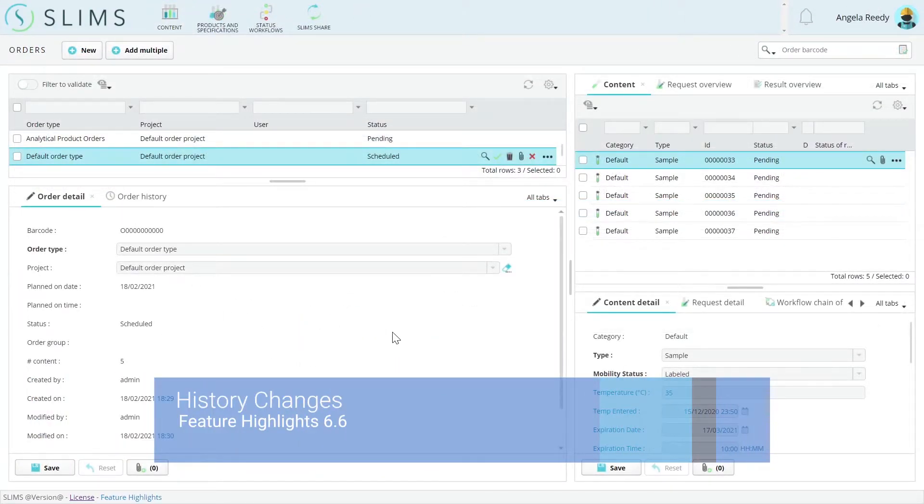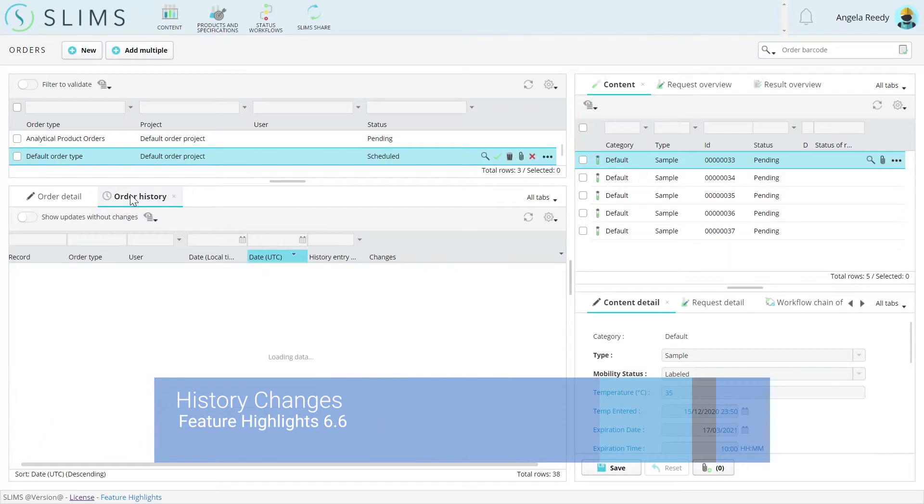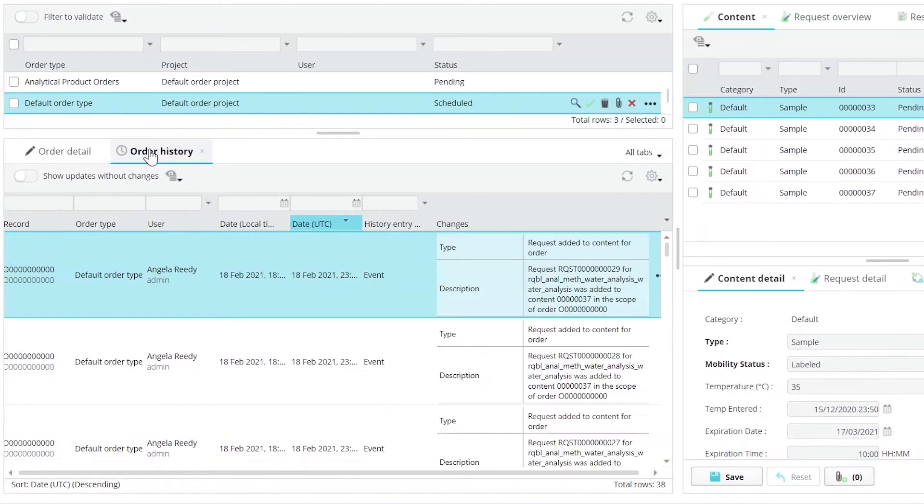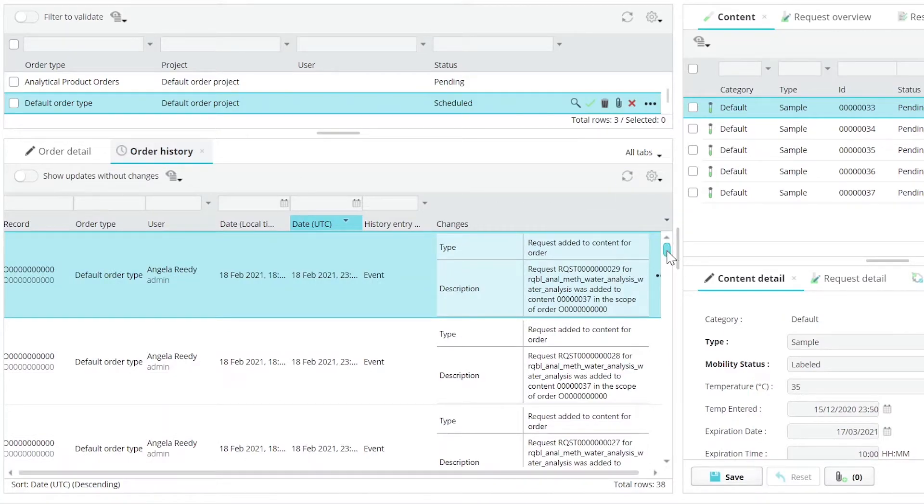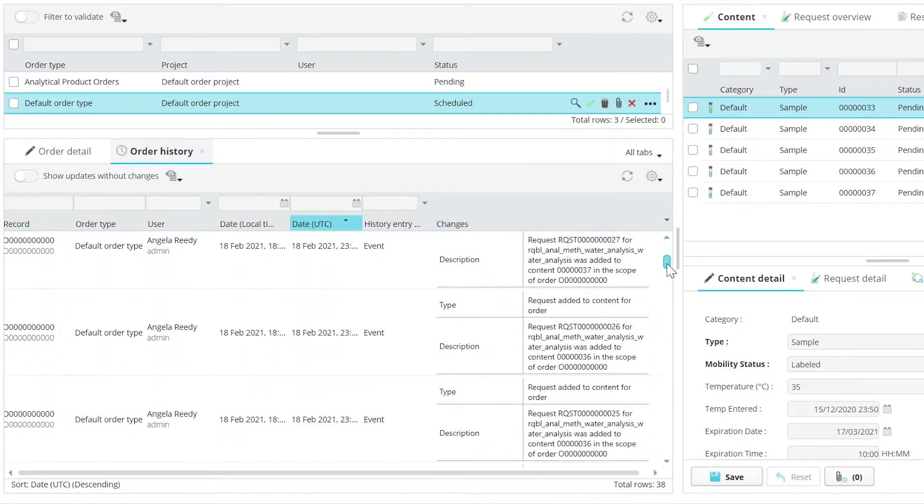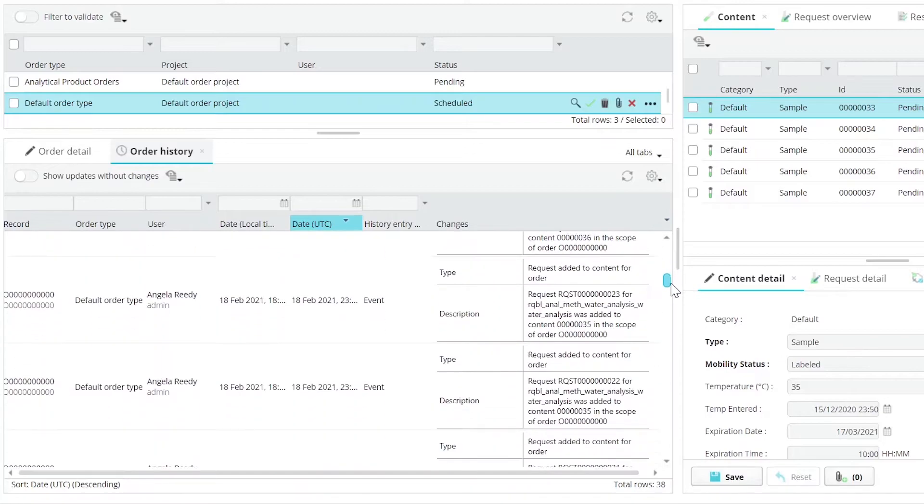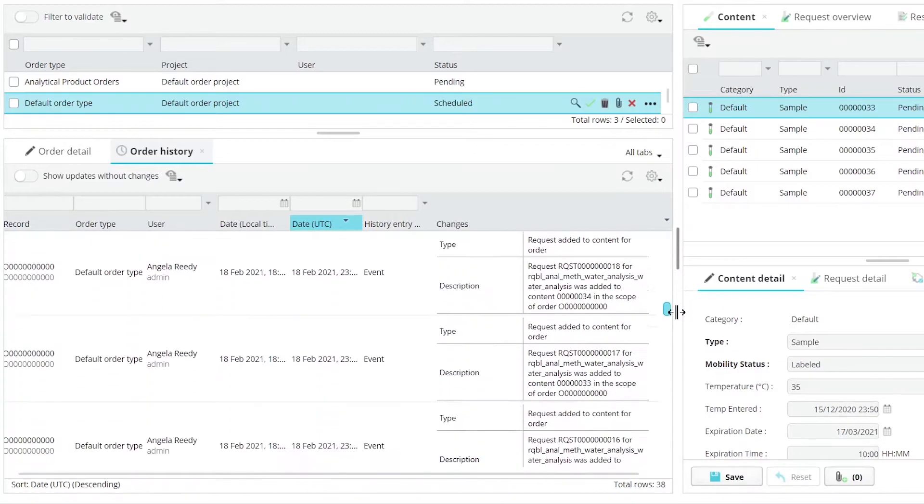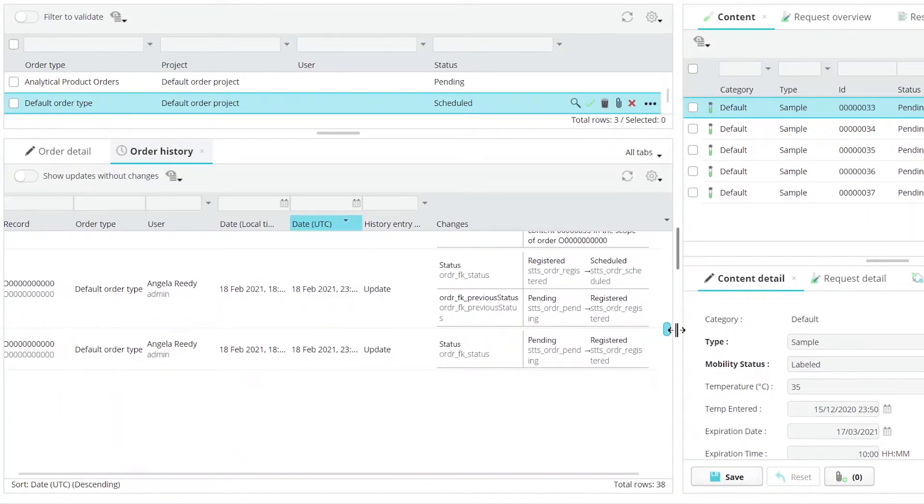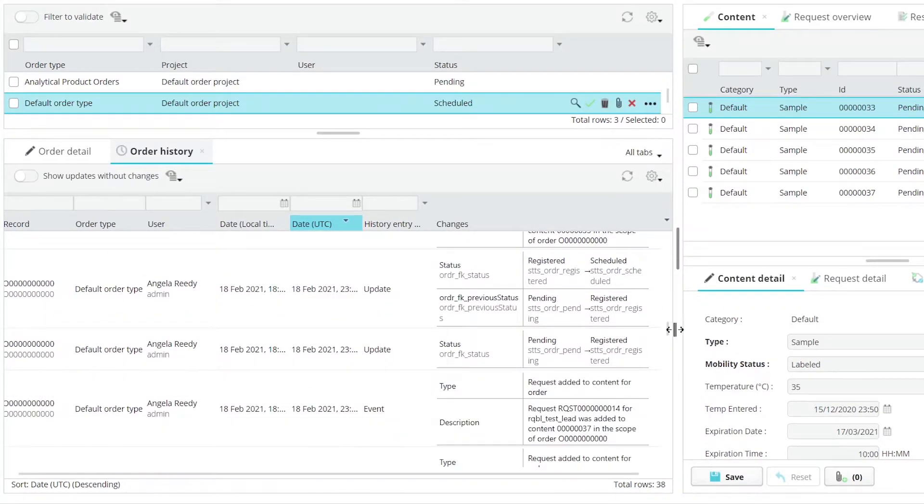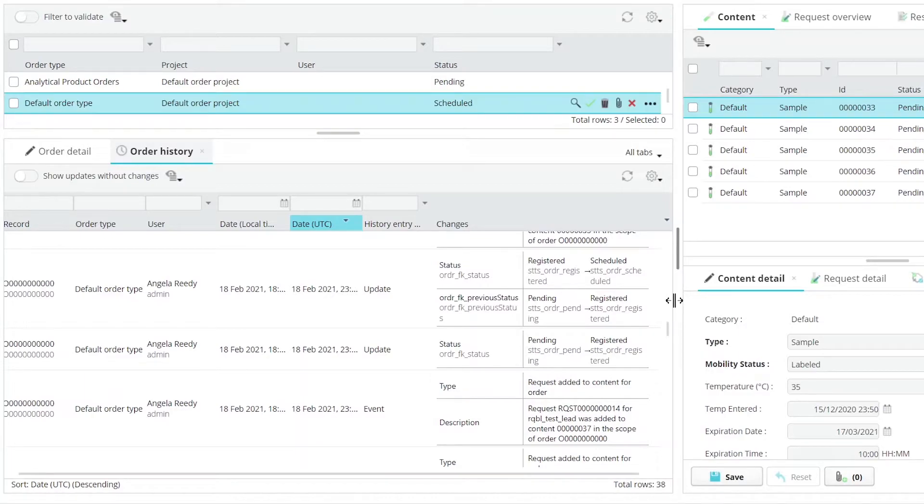Updates to history grids were made to improve readability, traceability, and expand compliance options. The first of these is the expansion of related events that are captured in history grids. This means more events are captured than before, but views can be used to filter for the records that you want to see events for.